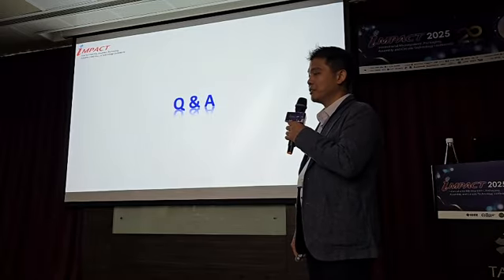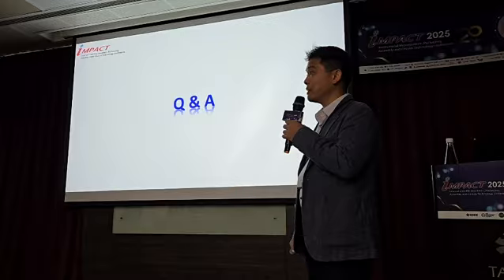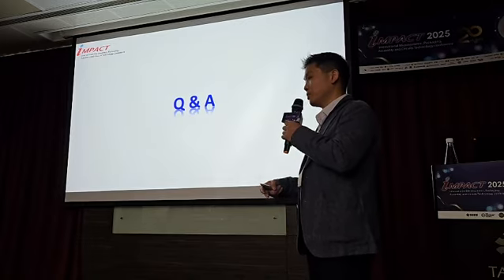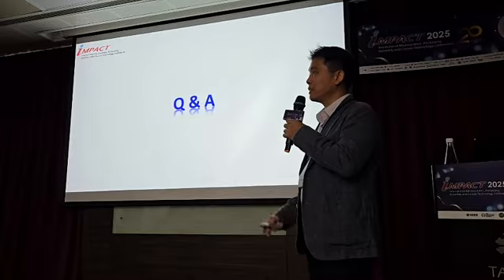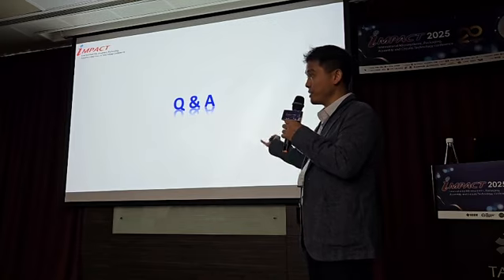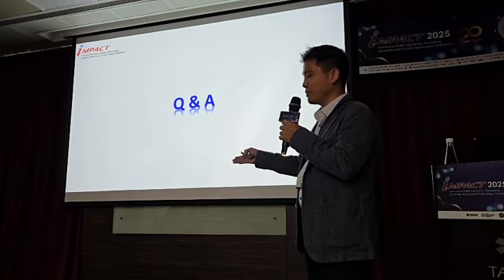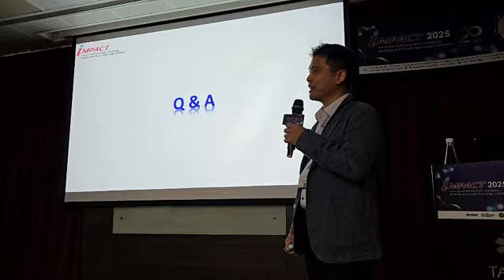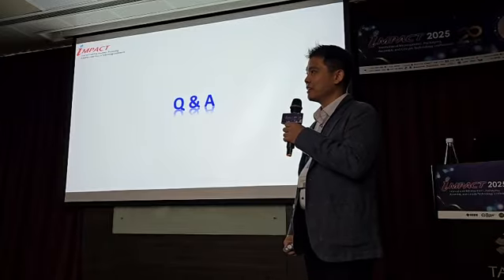If you are looking at a packaged microelectronic device after the fact, then certainly the cross section would be better. But once we backtrack to the source of the contamination, let's say what you see on the surface of the metals or the gold pad, then we can do a top-down measurement. That's okay in that case. So it's pretty flexible.